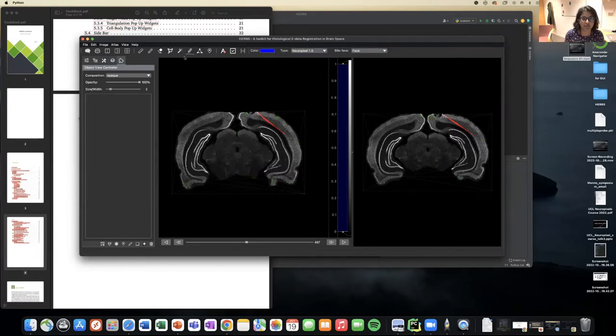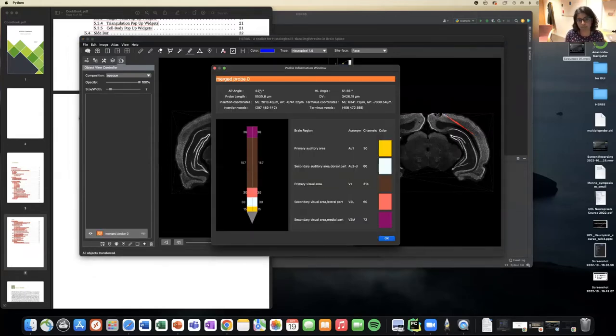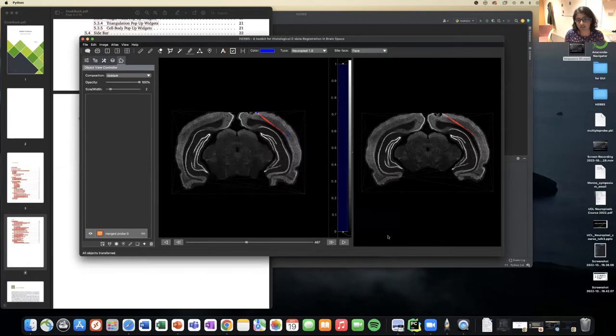And then go back to the probe maker that we saw during talk three, where I was showing you how to plan trajectories and use that on your histology—just two points, accept. And you have a merged probe that shows you the angle at which it was inserted, the length of probe that's inside the brain from the 2D histology that we've plugged in, and the regions that it has traveled and the estimated channels that it's recorded from.